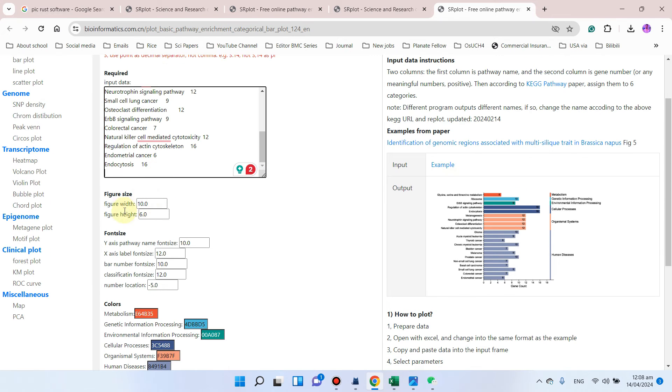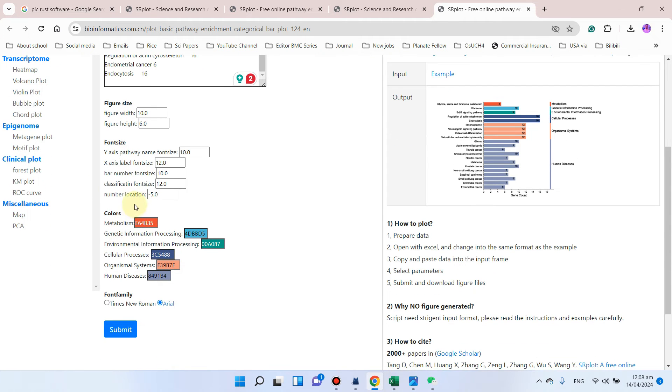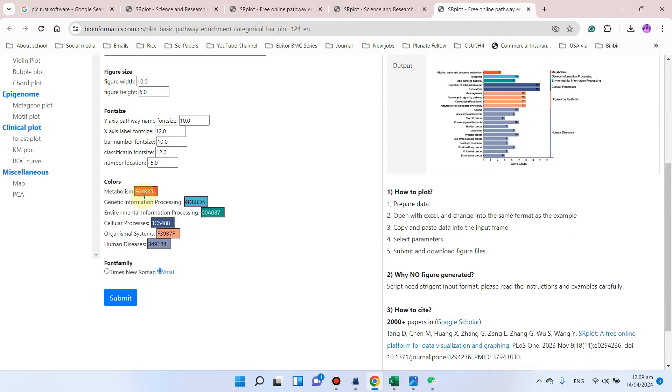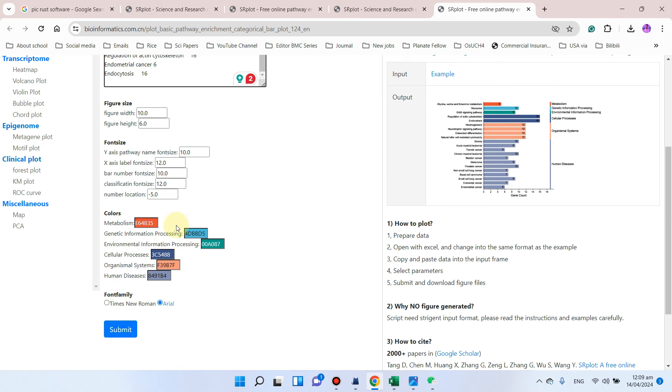We can adjust the figure width and figure height, and we can also adjust the font size if needed. We can also select the classification font size if needed, and we can also select the number of locations. For this maybe we can also select Times New Roman or Arial font family. We will simply click on the submit button.